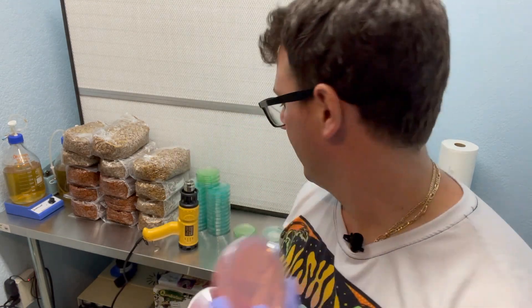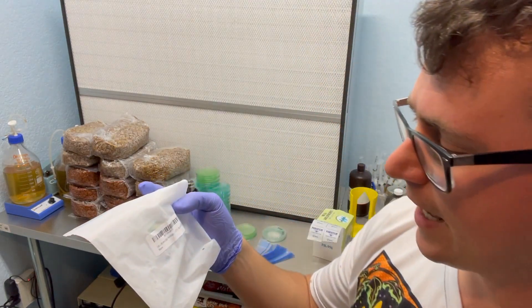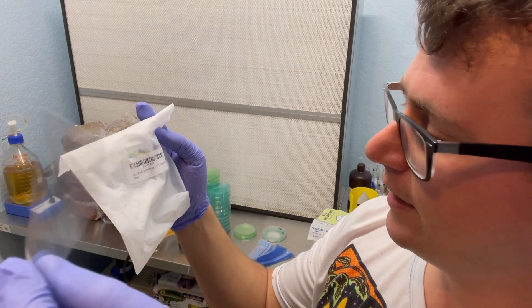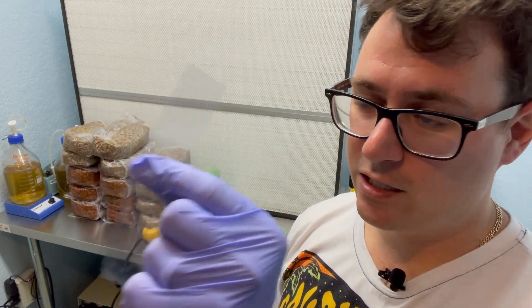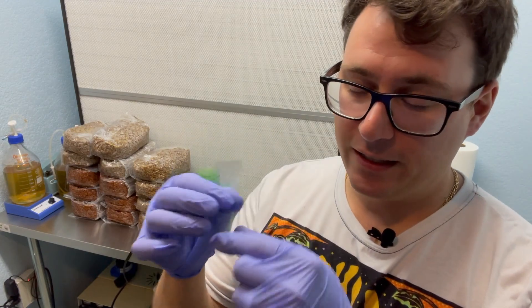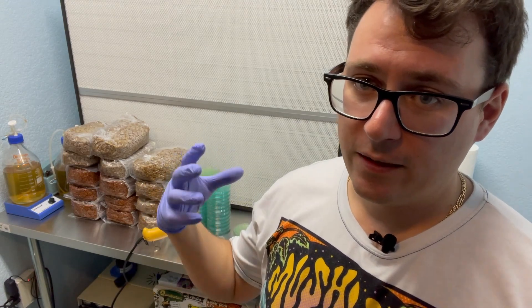Some people use a shrink wrap like this — it's a polypropylene plastic, or actually I'm not sure what kind of plastic, but basically it comes with a perforated strip that's 145 by 28 millimeters. I'll post the link on our Amazon affiliate page to the actual product. It fits around the petri dish perfectly and the idea is that it will keep the lid closed so no contaminants can get in, and it also allows the mycelium to grow without the media drying out.